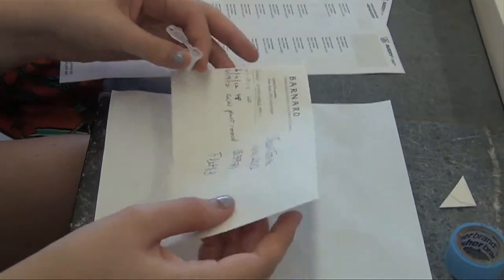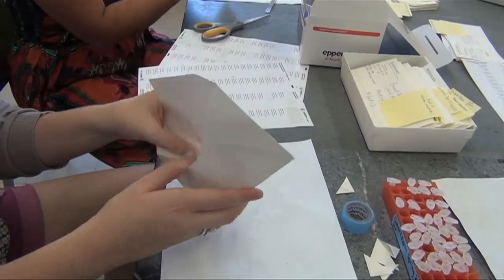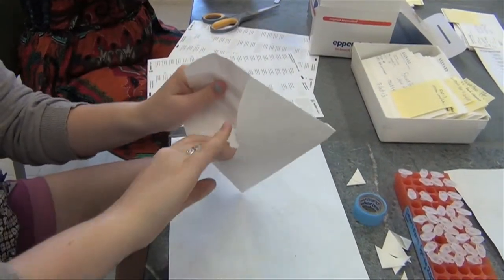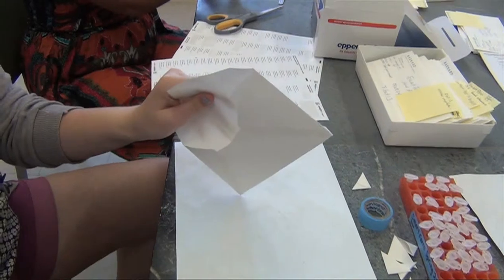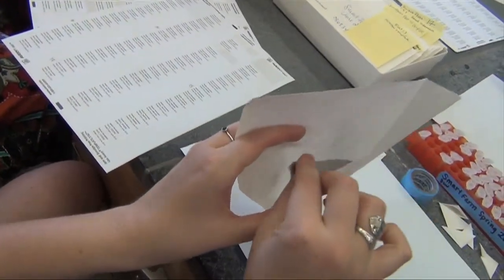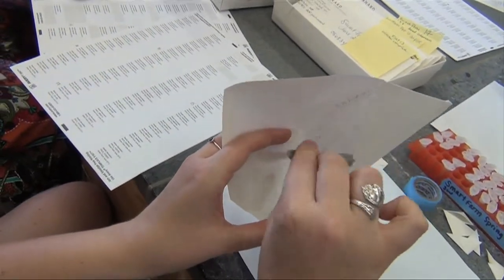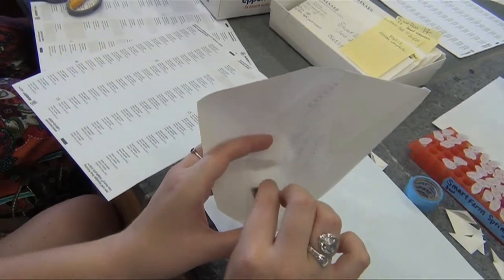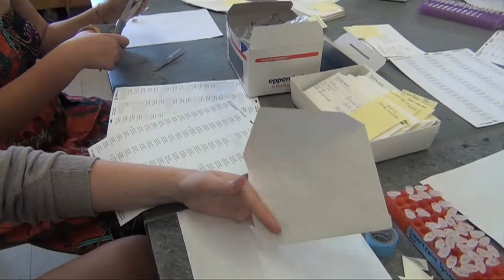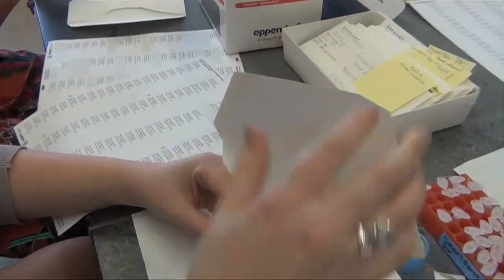At Barnard, we get the seeds into tubes by cutting the envelope. First, make sure to check that there are no plant parts, besides seeds of course, in the envelope. You may have to remove empty siliques that have fallen in. Knock the seeds down into one corner of the envelope, and then cut diagonally across this corner above where the seeds are. You've made a pocket. Use this to carefully pour the seeds into the tube.